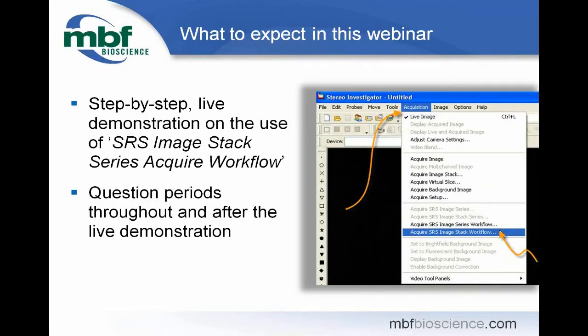Over the next hour, I will also take you through a step-by-step live demonstration on the use of the SRS Image Stack series acquire workflow, with question periods throughout and after the live demonstration.